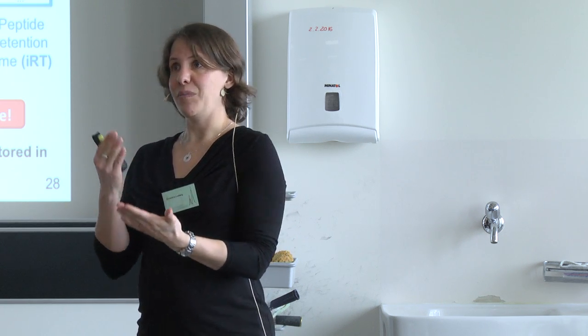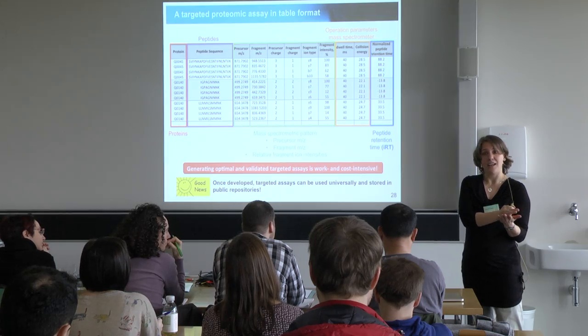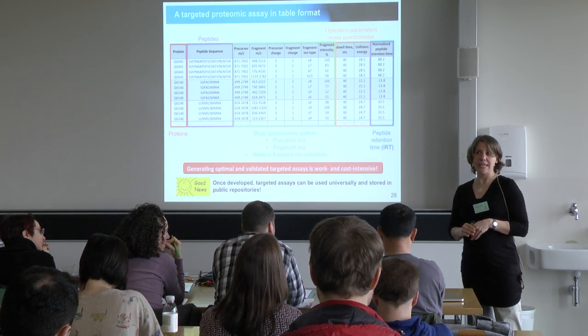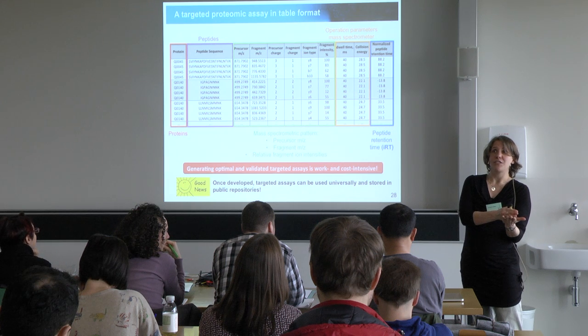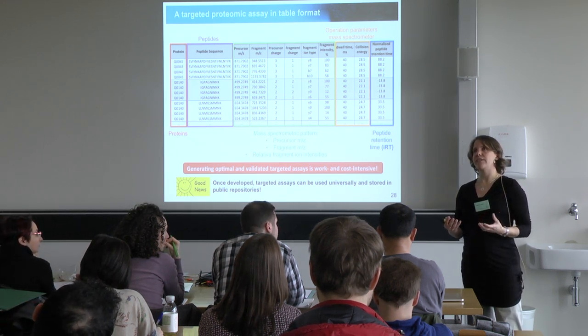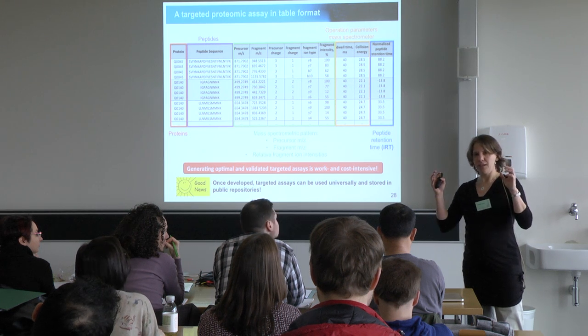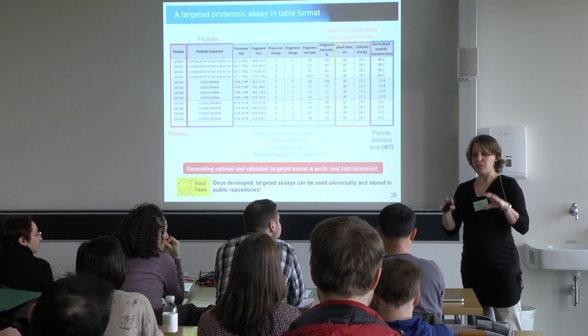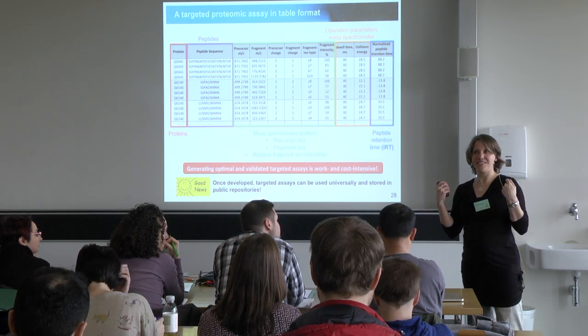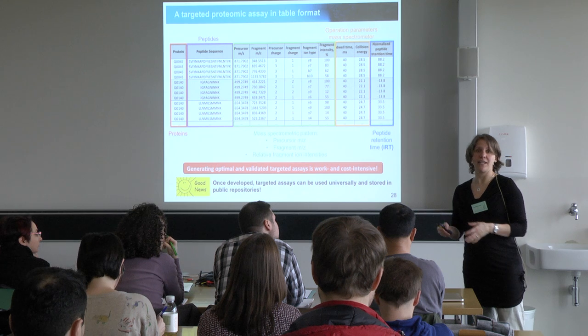So it can be that somebody in their cell line detects a peptide you don't detect at all in yours, and so on and so forth. Or you have a certain transition interfered that is not interfered in another background. And that's just another reason why it's so important to always start your experiment with several peptides, so that when you have outliers or differences, you can just easily get rid of them and still have something else to work with.